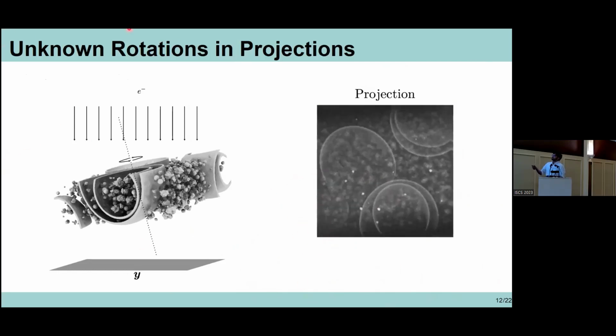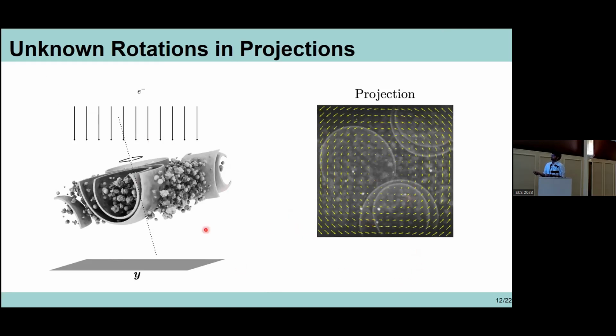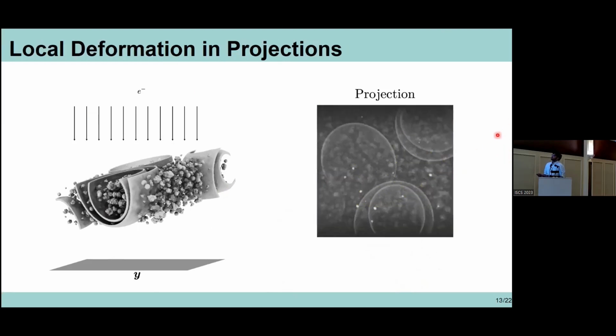You can see that the volume is rotated in-plane. The projections are rotated, so you don't need to consider other rotations when considering these deformations. This is represented by the 2D rotation matrix given here, where alpha m is the angle by which it rotates.